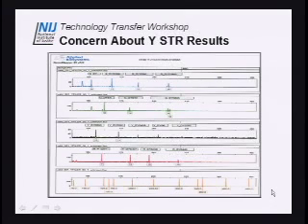Is there a concern with this? Okay, we're putting Y chromosome DNA in there as a Y probe. Here's a Y STR profile from those stained slides, not those particular cells, but from a slide that's been stained by FISH with the X and Y probes. Gets a nice Y profile. So this method does not affect the Y chromosome testing or Y STR testing. That's always an important concern. Would it be an issue? Yes, it would be, but here we have a nice clean profile. Actually, probably not a full profile, but it's pretty well up there.